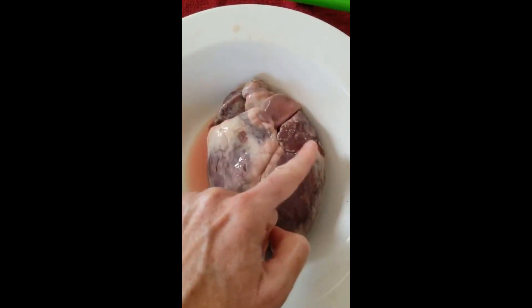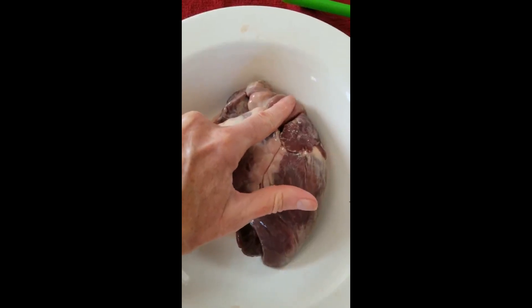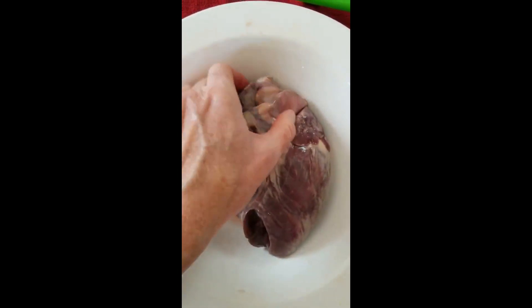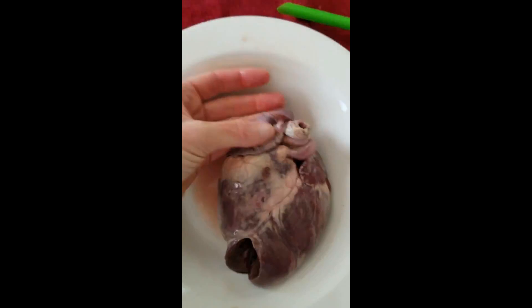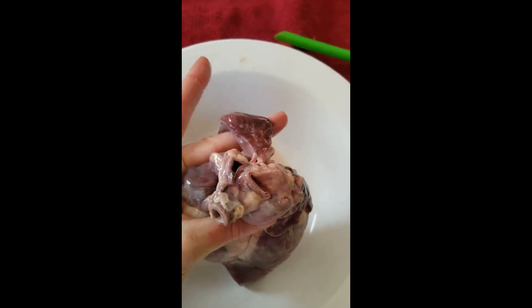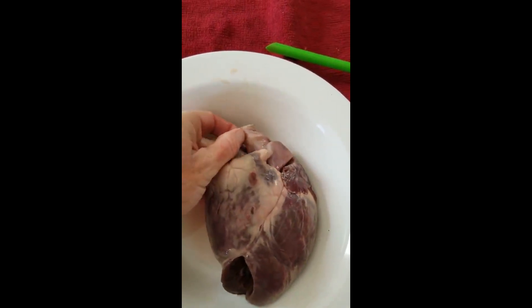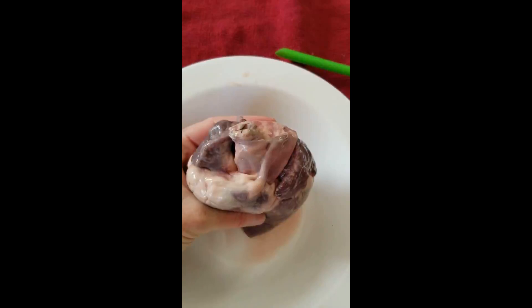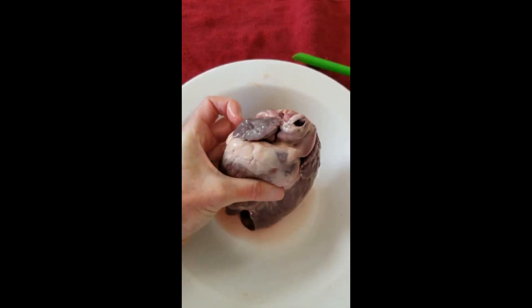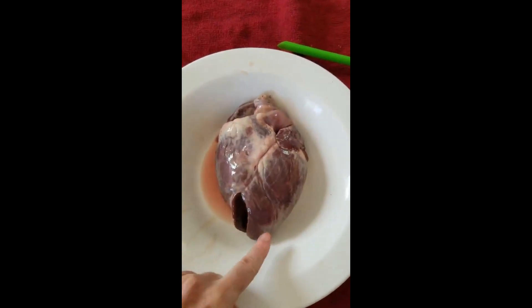The top part of the heart is actually referred to as the base, and the base is where you're going to have major blood vessels emerging. This is called the pulmonary trunk and it will branch to become the two pulmonary arteries, one going to each lung. There's actually a chunk of lung tissue still attached — that jiggly red stuff is a bunch of lung tissue. Also on the base of the heart you can see this is part of the aorta coming here.